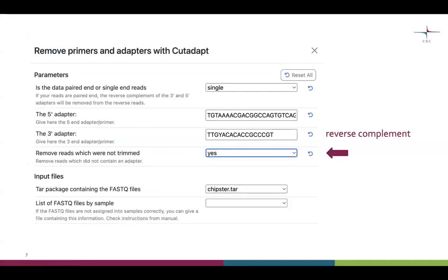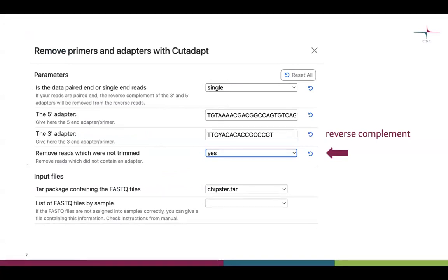Here is an example of how the parameter window for CutAdapt looks for removal of primers. We have to define that our data is single-end reads, give the sequence for the forward primer and the reverse primer — note that the reverse primer has to be in reverse complement in this case — and we want to tell the tool to remove reads that were not trimmed, so reads where no primers were found should be thrown away. As input, we give our FASTQ files combined into a TAR package.